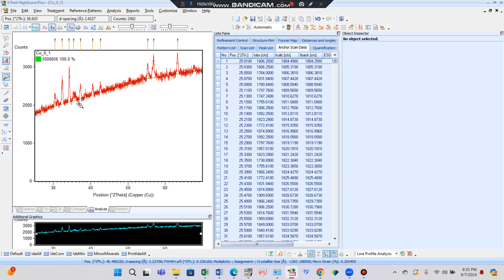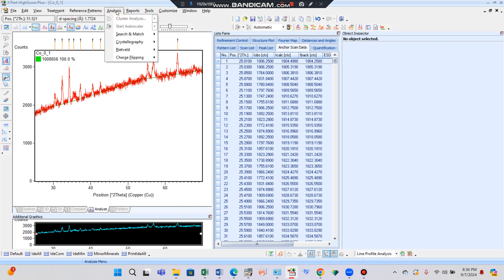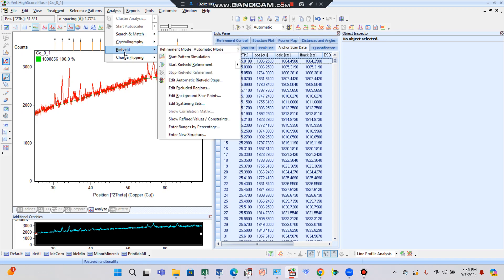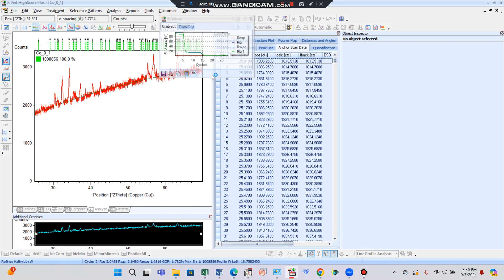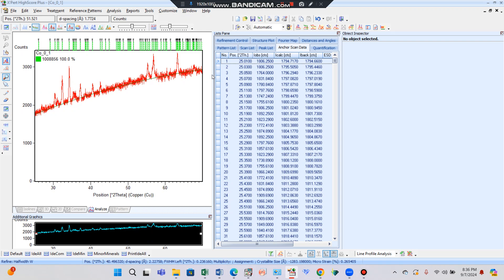Now when all the peaks are matched and accepted, it is time to execute the Rietveld refinement. Click Analysis, and in Analysis you can see Rietveld, and here is Start Rietveld Refinement. Click Start Rietveld Refinement — you can see the refinement is being carried out as the iteration continues until the difference between I-observed and I-calculated becomes minimum.